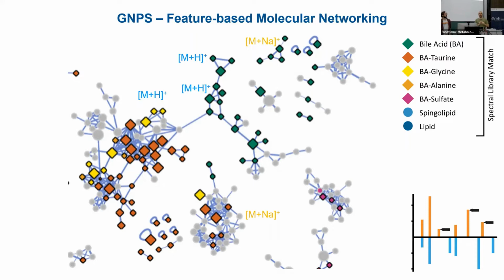For the intro, we saw that this is next level and might be too complicated, but you will see if you watch some of Robin's tutorials for MZmine 3, it's very easy to just set this on as a next step. So this is called ion identity molecular networking.